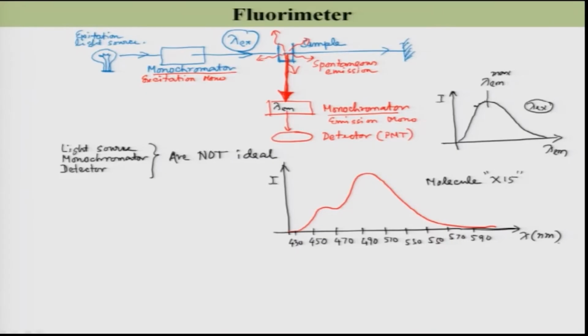So, this is the emission spectra, and imagine that this is the actual emission spectra of the system. You have taken this sample in your sample holder, and your sample is over here, and you use a particular excitation wavelength of your choice. Let us say in that case it is also known that lambda excitation is equal to 400 nanometer.